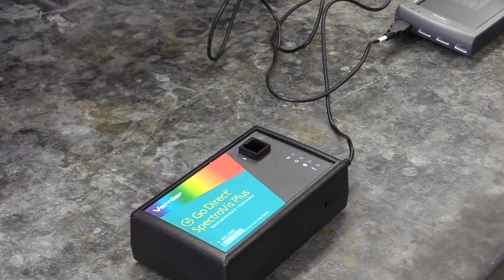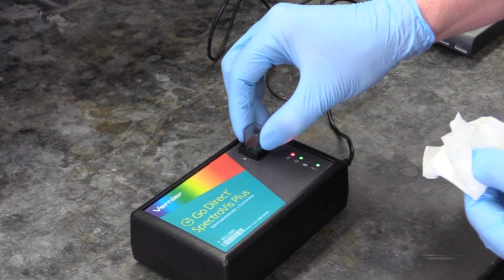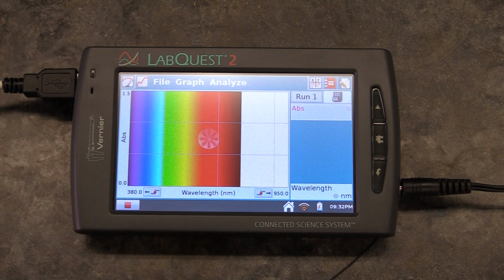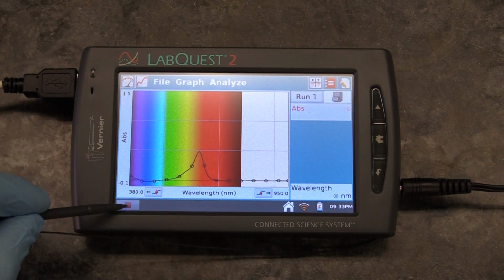To measure a solution's absorbance, put some of it into a cuvette, enough to fill the cuvette about 2/3 full or so, then wipe it down like you did the water cuvette, put it in the sample holder, and press the play button on the computer screen. Give it a second to finish the reading, then press the stop button.